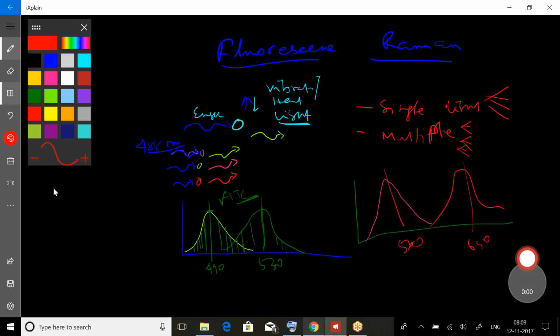So these different fluorochromes are associated with different information about the cells. For example, we want to study 5 proteins expressed by the cell. We use 5 different fluorochromes conjugated to 5 different antibodies that bind to the respective proteins, and they give the information.